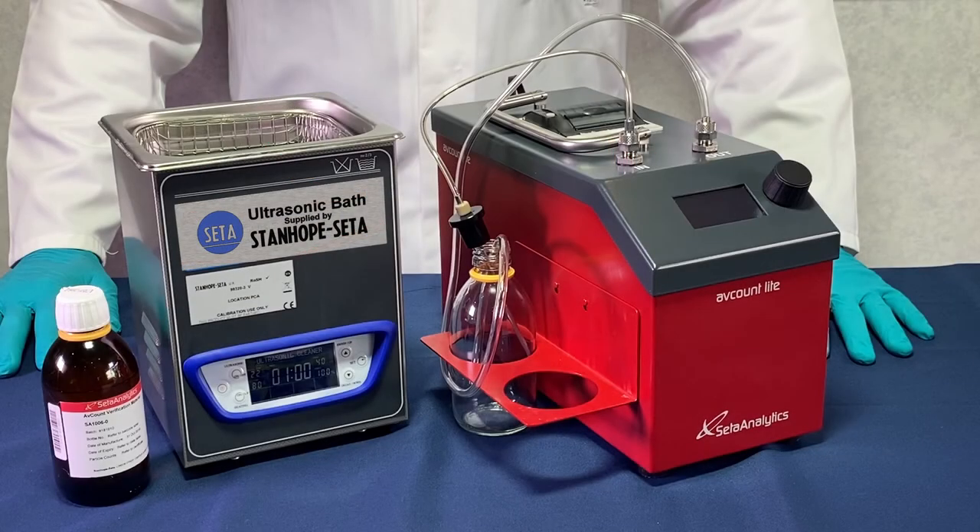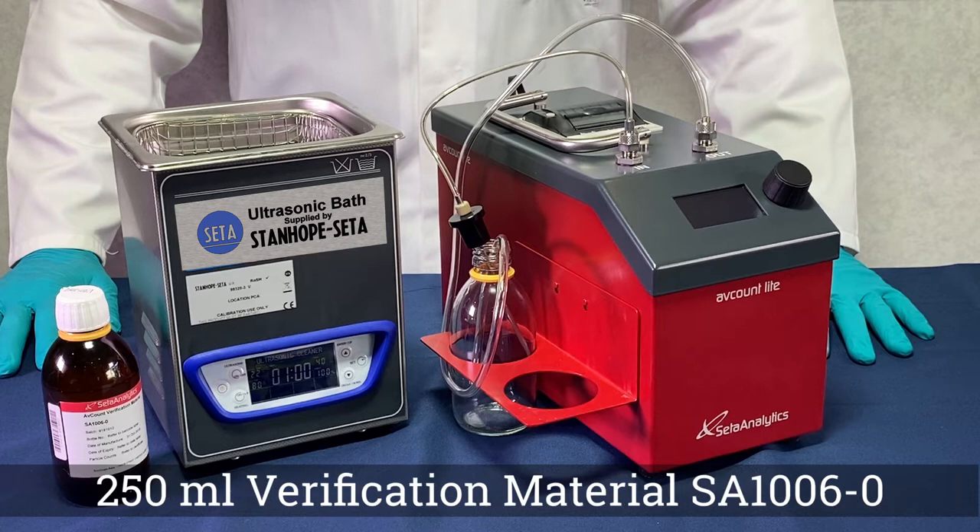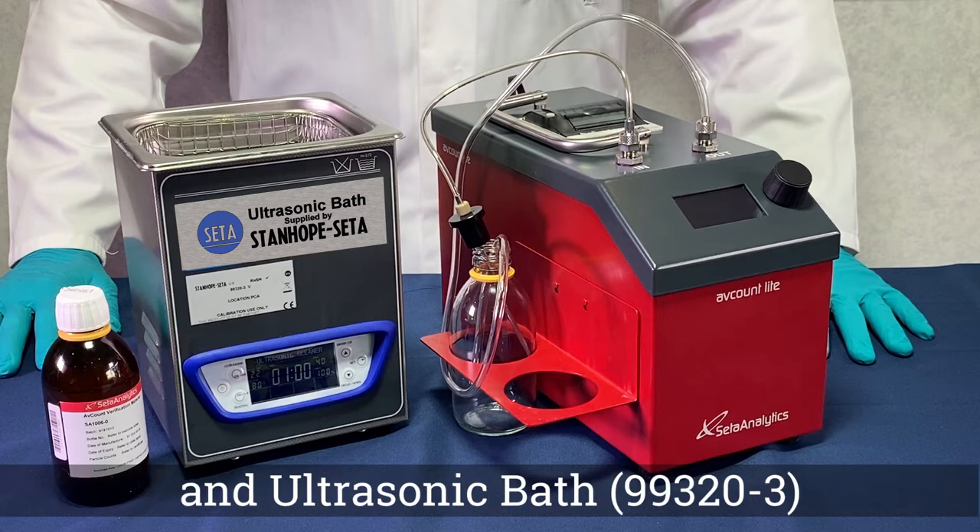In this video we will demonstrate the verification procedure for your Avcant light SA1800-2. You will require your Avcant light, a bottle of verification material part number SA1006-0, and an ultrasonic bath with a minimum power requirement of 3 kilowatts per meter squared.